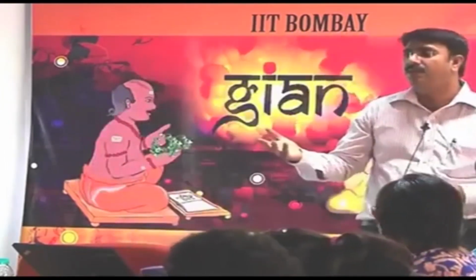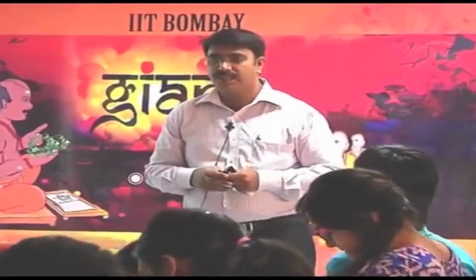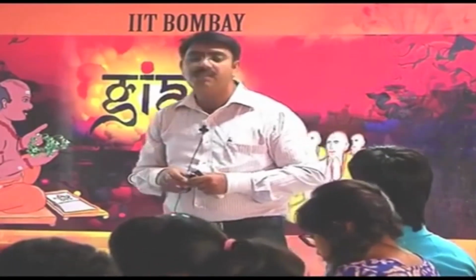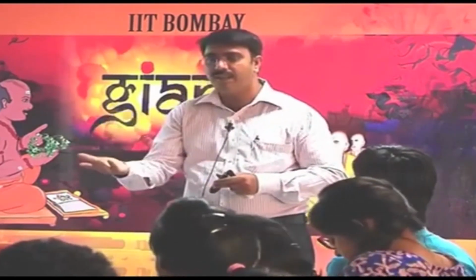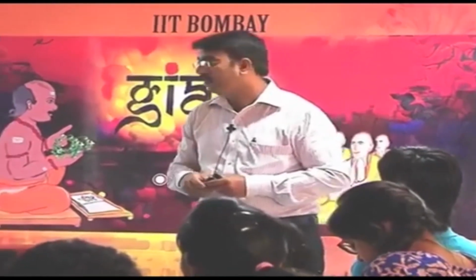In the case of SPR also, people regenerate. But if something goes wrong with SPR chips, you have to throw away the complete sensor. That sensor costs something like $150 to $200 depending upon the chemistry you are buying. Here we are providing 96 sensors, so 96 different experiments you can perform. That is the advantage.